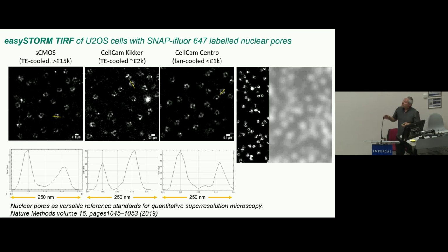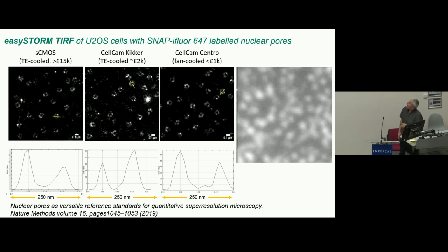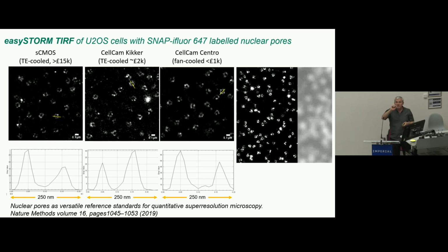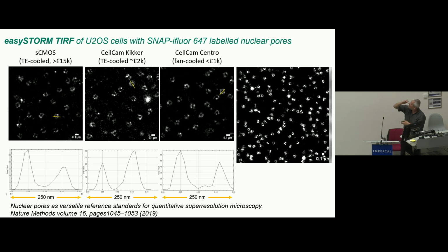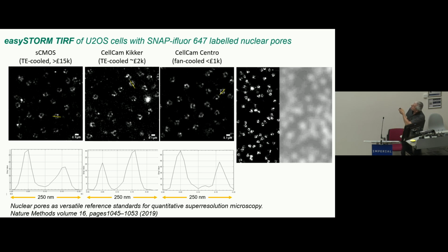There is lots of crystallography data to support that this nuclear pore has 8 subunits. It's like a window, and the diameter is around 100 nanometers. But when you are in super resolution, you start to see the subunits. And when you plot an intensity profile around every one, then you can start to see that there is an improvement in resolution.